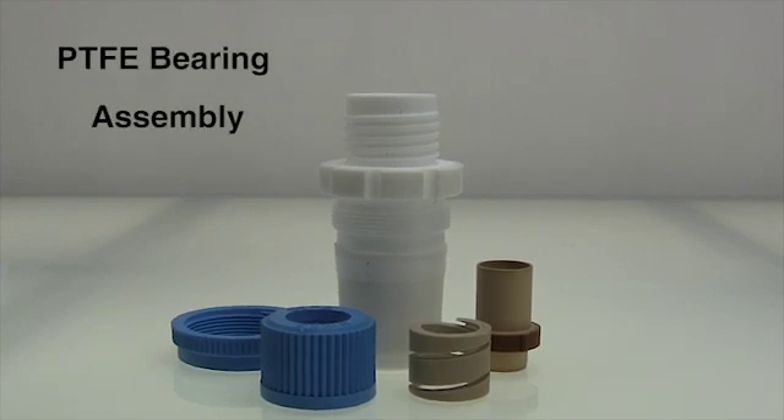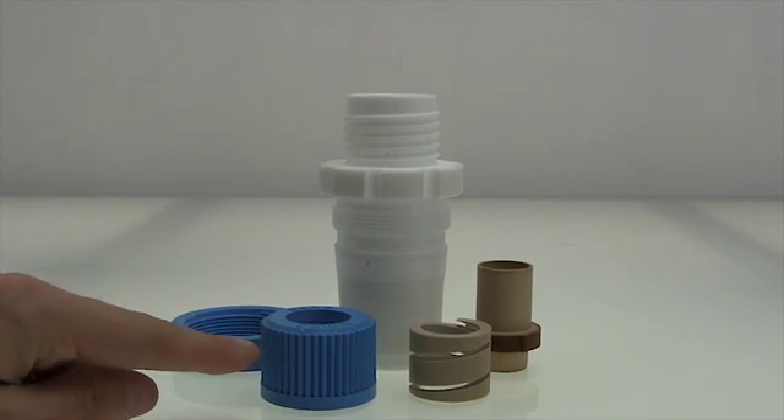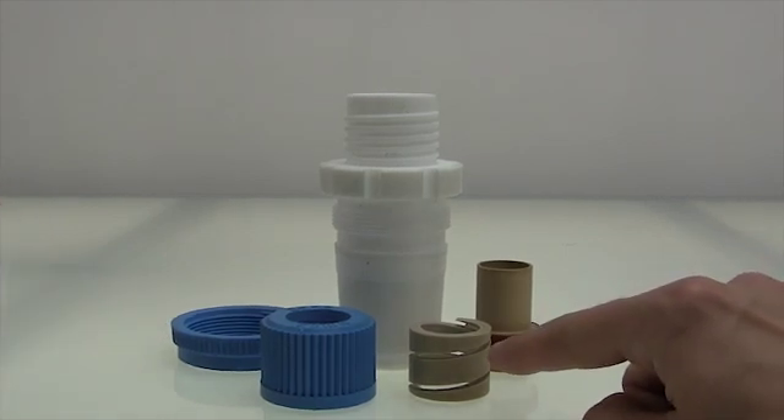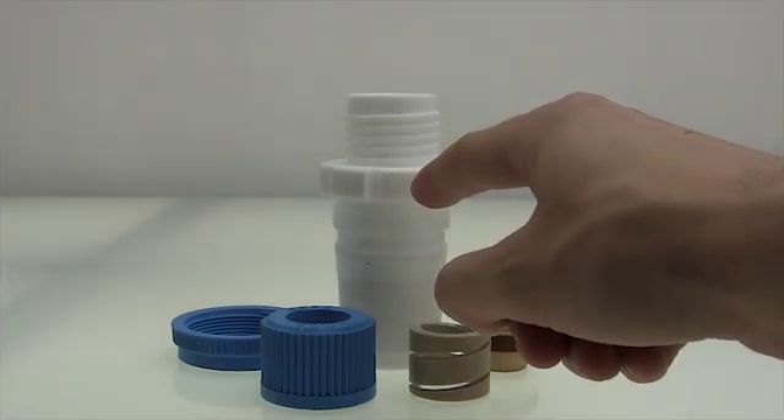Hi, I'm Dash. Today we are assembling a PTFE bearing. Make sure you have your components including a screw cap, a loosening nut, a compression spring, a sleeve, and a PTFE adapter.